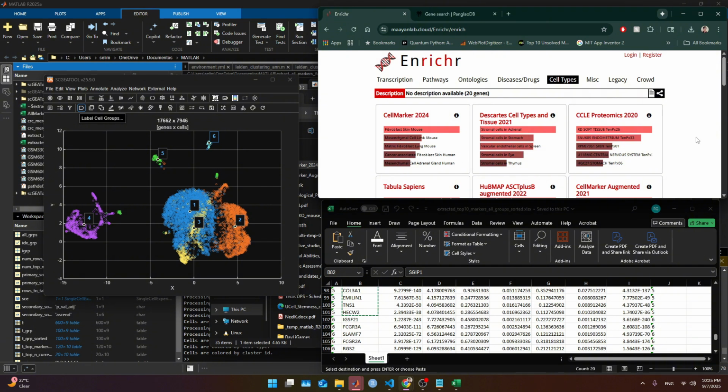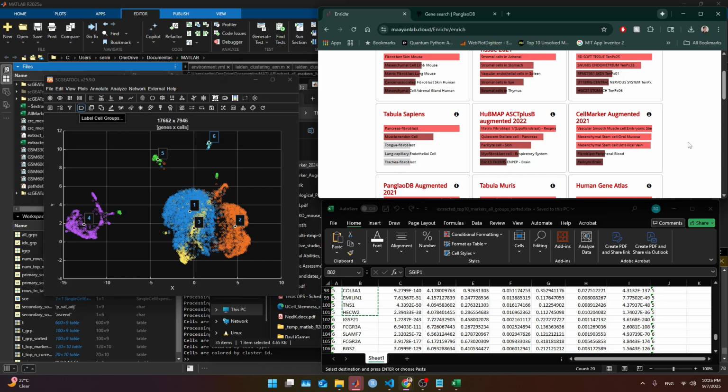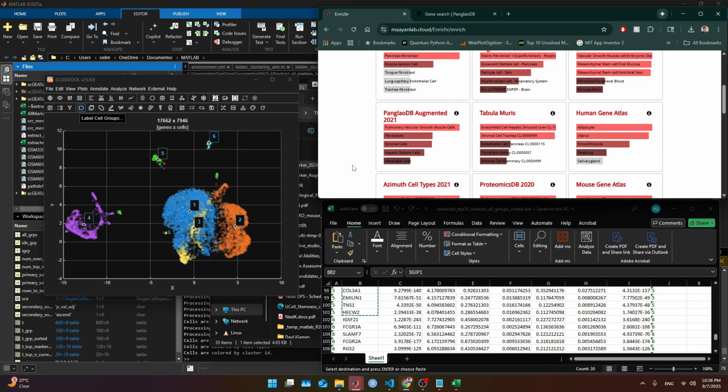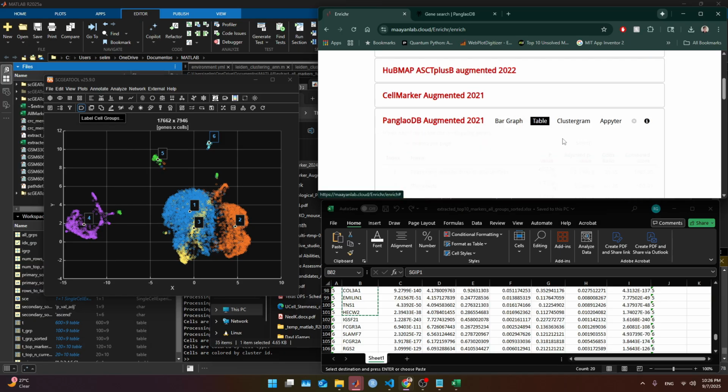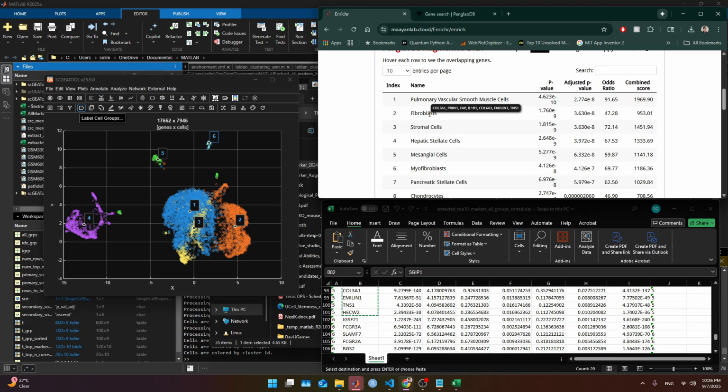Cancer-associated fibroblast skin. Possible, but I will not call it like that. I'm looking just for fibroblast here. Great. What markers? COL3A1, PRRX1, FAP, COL6A3. So that's definitely fibroblast. Those markers we had before.